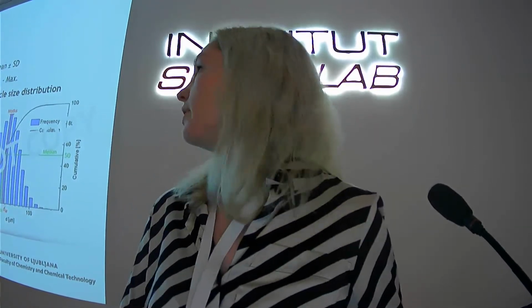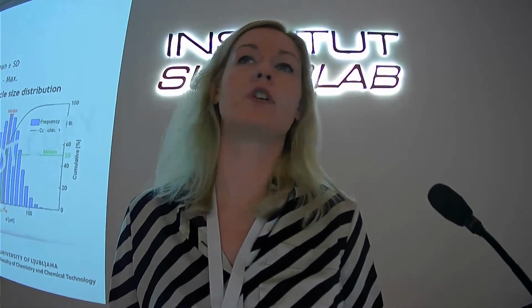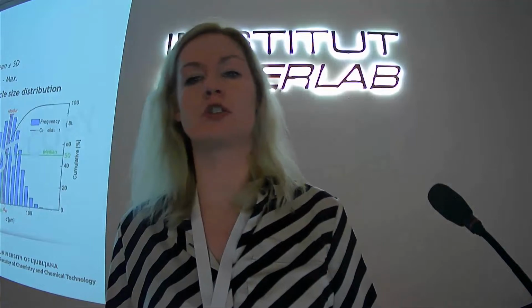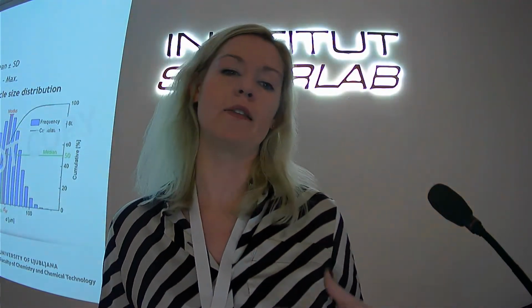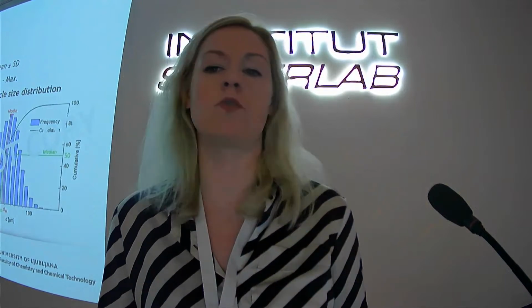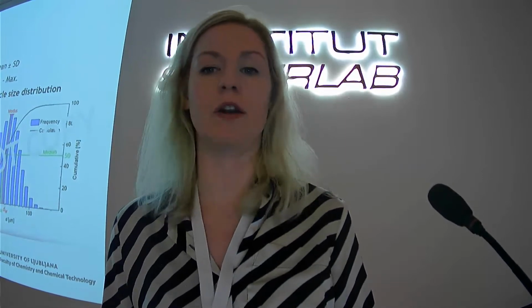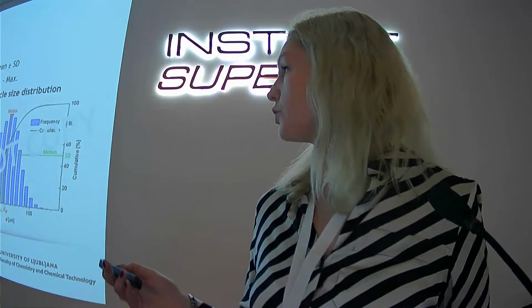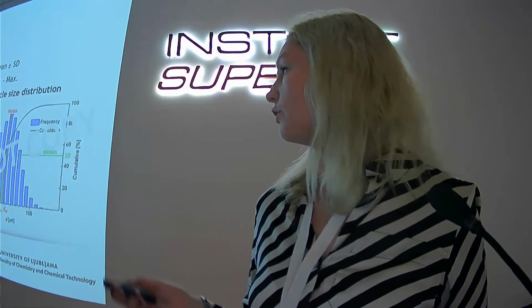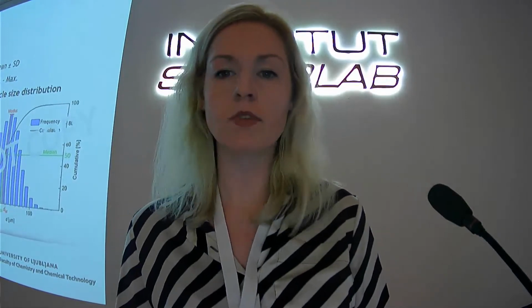Of course, you should always mention some mean size and standard deviation. Some of the articles sometimes mention just the minimum or the maximum size of the particle. And maybe the best way to really show what kind of particles you have is the particle size distribution, so that you are actually showing the distribution of the particles in your sample.